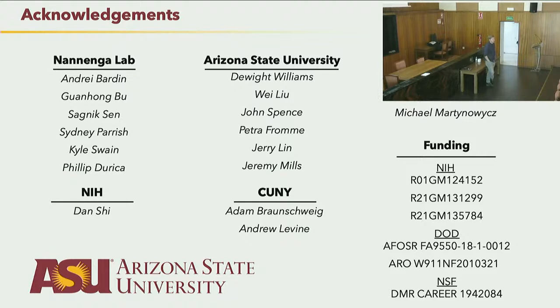Yeah. So I've collected data at both 200 kV and 300 kV, both proteins and small molecules, and they all work fine. So the original work I showed when I was in my postdoc, that was on a 200 kV instrument. And I know they've done then small molecules on a similar instrument. At ASU, we have a 300 kV instrument. And so all the work I showed later, that was all for protein, and that was all on the 300 kV instrument. And so while there are differences between 200 and 300 kV, and you could make an argument for which one's better, I haven't seen like, oh, this one's better for small molecules, this one's better for proteins.